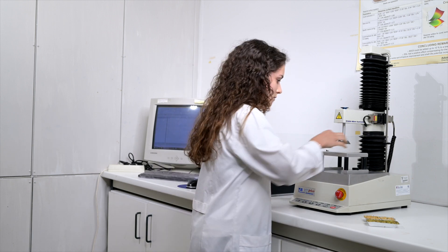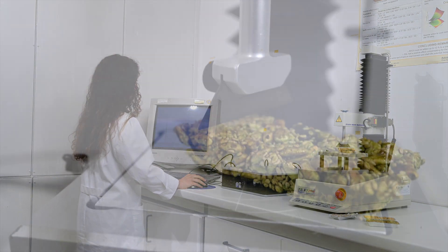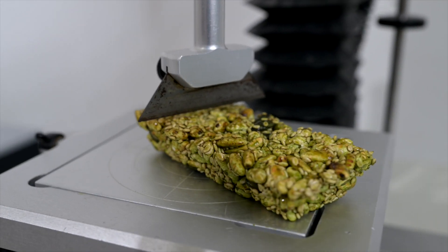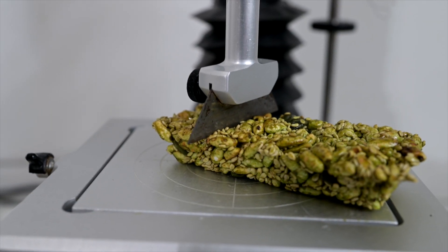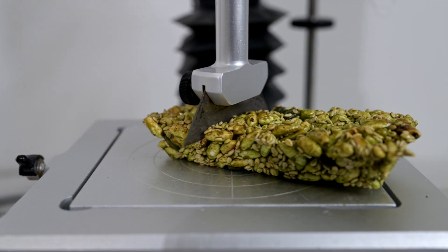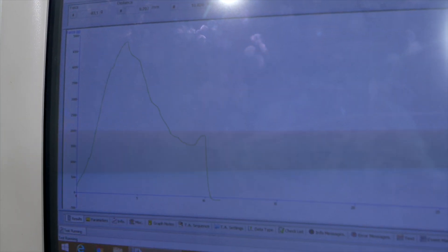I use this texturometer to measure the texture and to know the impact of the incorporation of microalgae in the texture of the bars. This equipment produces curves that show us a peak, which is the maximum force to break the bar. The results show that the bars with Chlorella are harder than the control bar, because the protein gives structure to the bars.